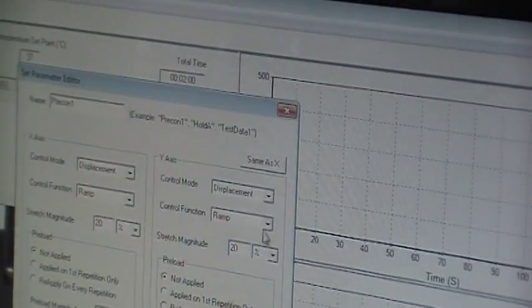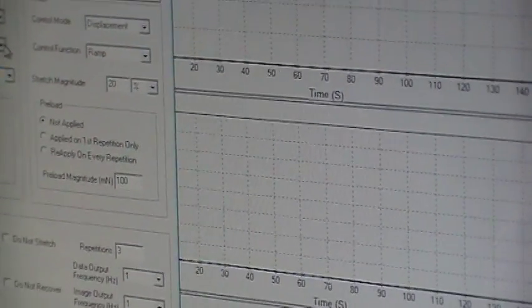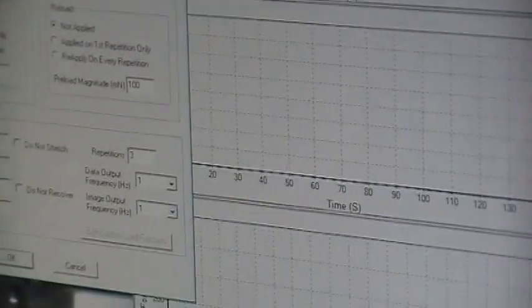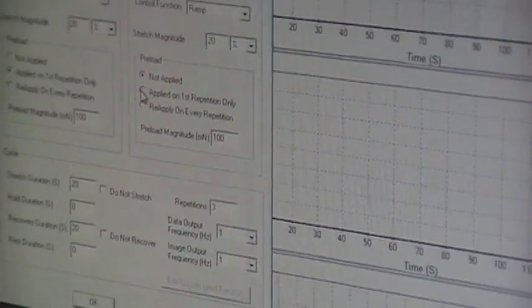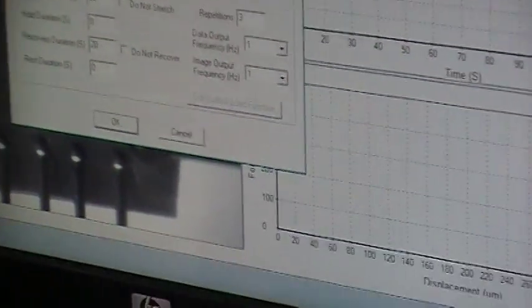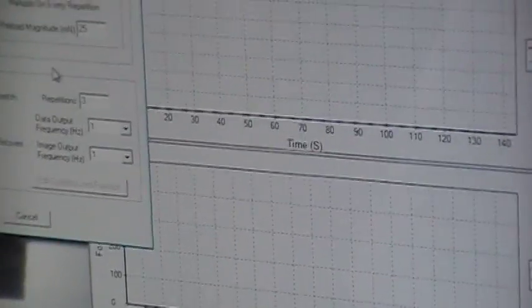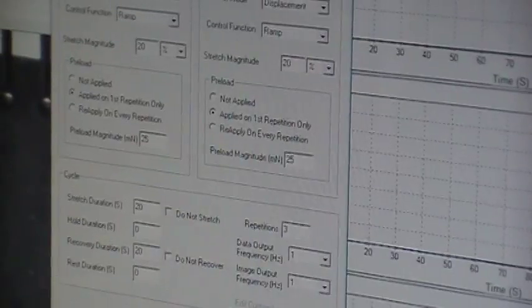What if you are setting some kind of displacement range or strain range, or stretch range that is beyond your load cell? There's a feature that will automatically shut down the test when it goes beyond the maximum load. Okay, that would be detected by the program. Yeah, just set as X. So it'll do the same thing as if you hit the stop button there, but automatically.